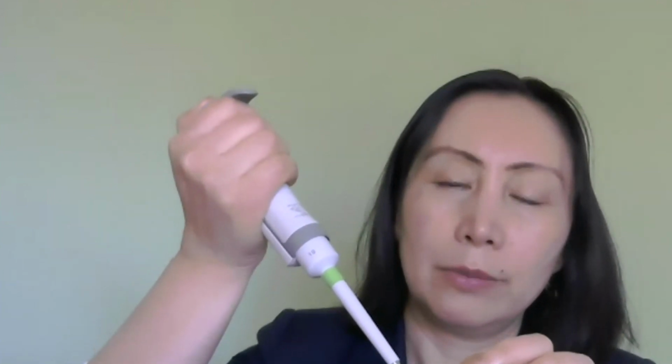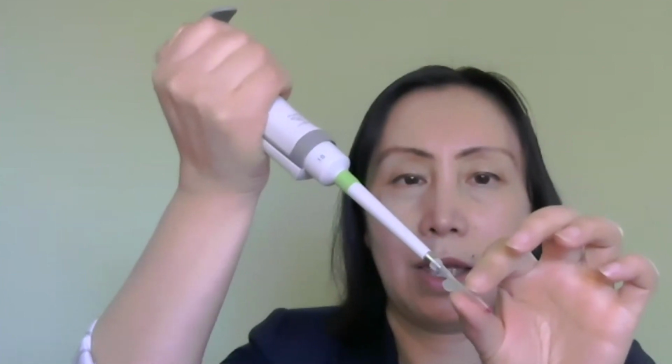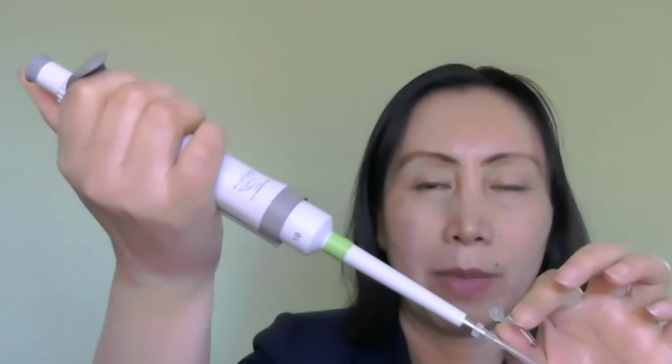I got a new tube and I put it into the new tube, press down my thumb all the way to the second stop, then release my thumb, and change the tip.